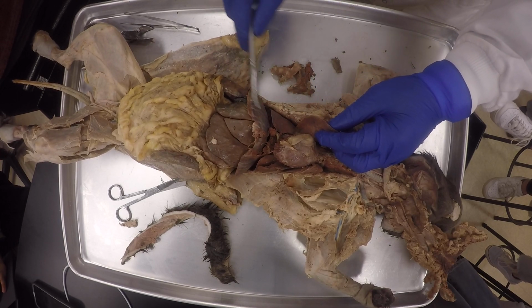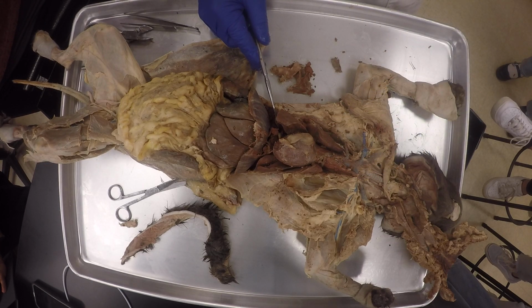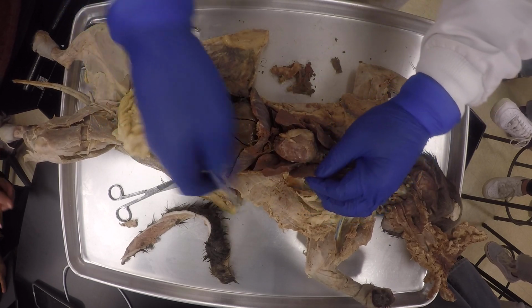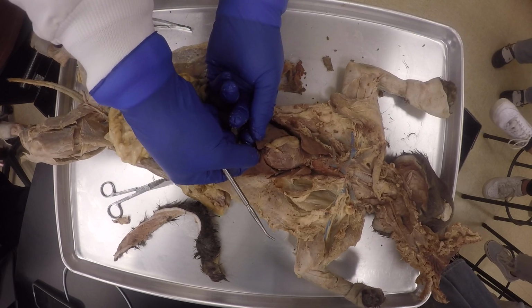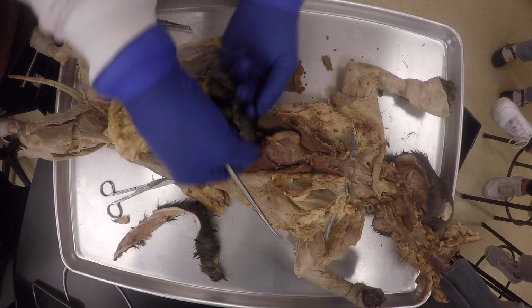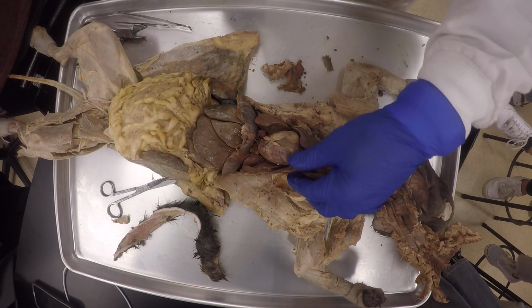Right cardiac lobe. And then what would this be? You see it's wrapping around the diaphragm. This will be the right diaphragmatic lobe. Isn't that so easy? And then of course this will be the left diaphragmatic lobe, left cardiac lobe. Look at how the cardiac lobes wrap around the heart. It's just amazing to me.